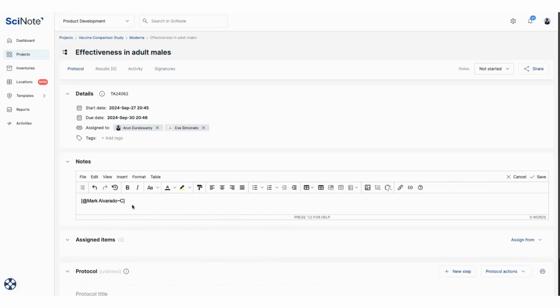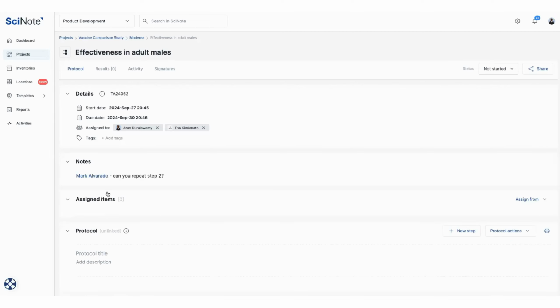You can select a user and you can leave them a note, a comment, a question. So in this case, maybe I'll let Mark know. So now Mark is tagged in this comment. He's going to receive an email notification letting him know that I've tagged him in a comment or in a note in SciNote.